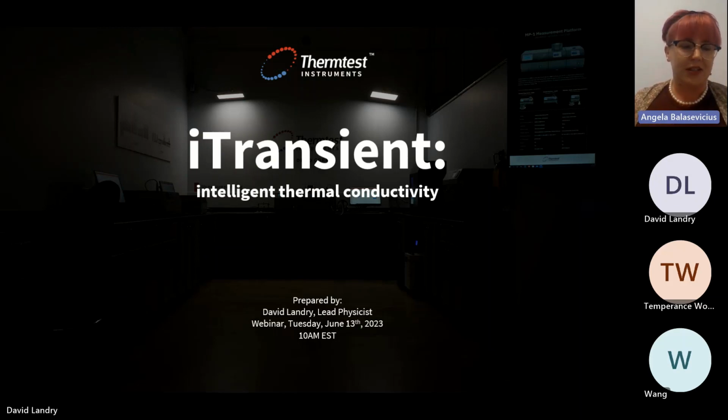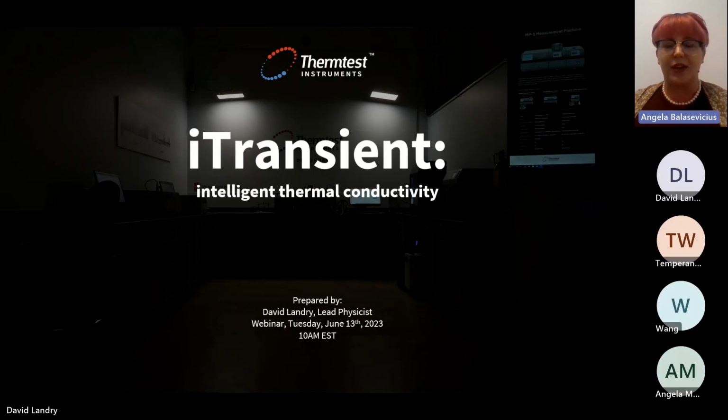We're here to delve into the exciting world of thermal conductivity testing, specifically focusing on Thermtest's innovative iTransient algorithm and its applications in Transient Plane Source methods. Our speaker today is the accomplished physics lead at Thermtest, Mr. David Landry. With 5 years of experience, he's made significant contributions in upgrading the company's measurement platforms and testing techniques.